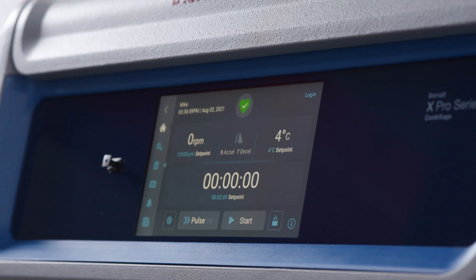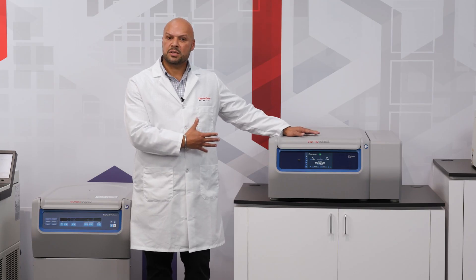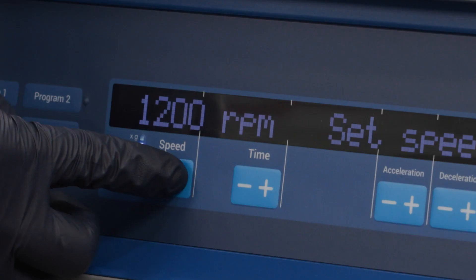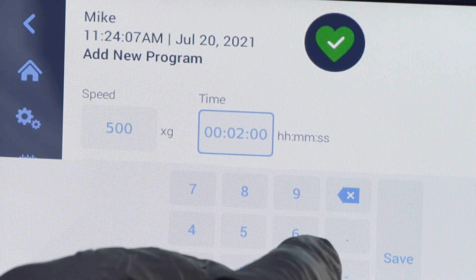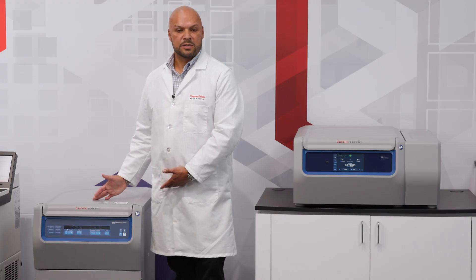The X4 is going to present increased speed accuracy where you can set your RPM and G's to a plus or minus 1 increment, where on the ST4 it will only be plus or minus 100. On the X4 you can set the timer to hours, minutes, and seconds which increases your accuracy, compared to the ST4 where you can only do hours and minutes.